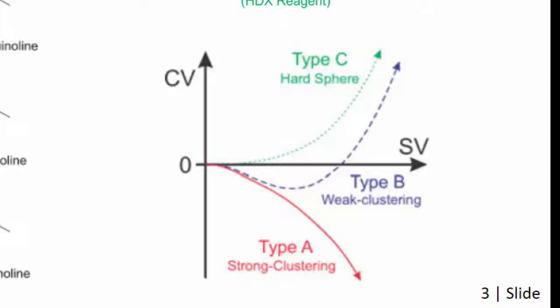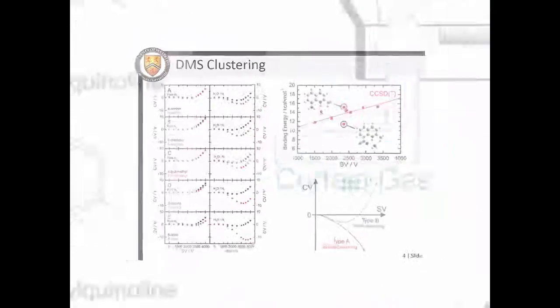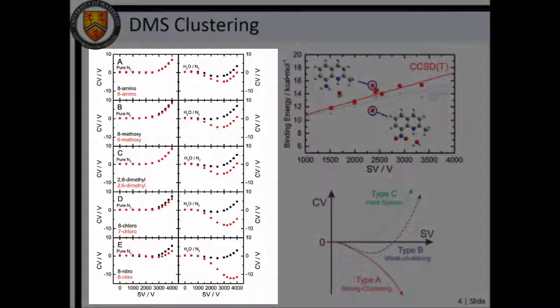By monitoring ion transmission as a function of the AC and DC voltages, we are able to determine whether the molecules interact strongly or weakly with the DMS atmosphere, or if the ion is essentially non-interacting. Since different isomers exhibit subtle differences in their physicochemical properties, the positional isomers of the quinoline derivatives can be separated based on their interactions with the DMS collision environment.